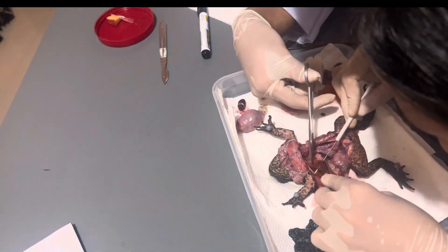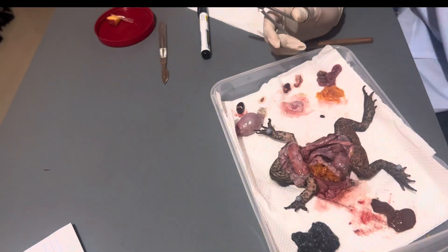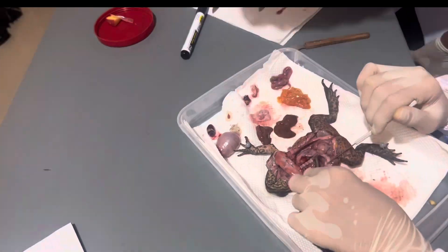What we have here is the spleen. This is where blood is produced, stored, and destroyed. And this is the liver. There are three lobes in the liver of a toad that produces bile. It filters toxins from the blood and stores sugar. While in the human liver, there are four lobes.